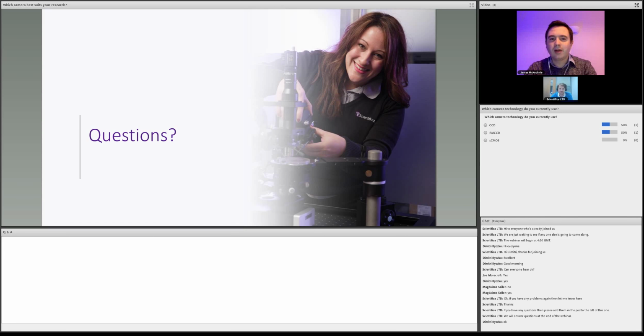Okay, so I think we probably want to look at this offline to understand it more. But from what you're saying there, it sounds like if you're using a mechanical shutter, that will be a very problematic point, because that takes time to open and close.